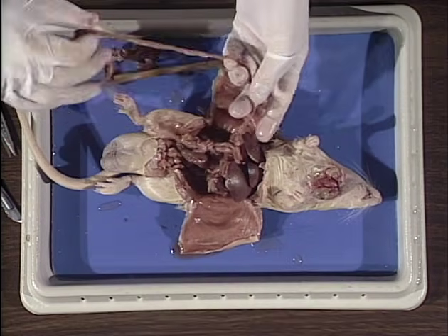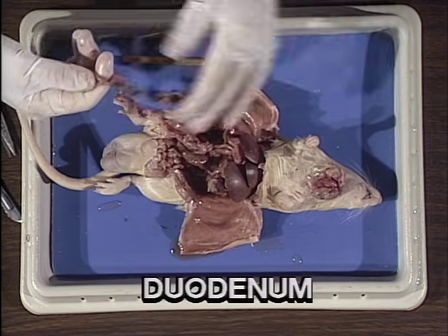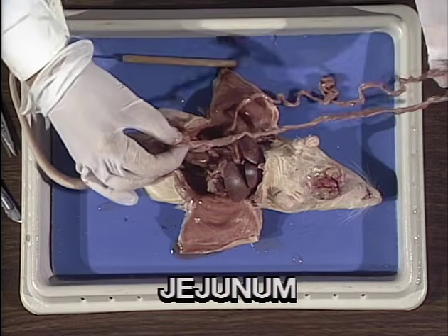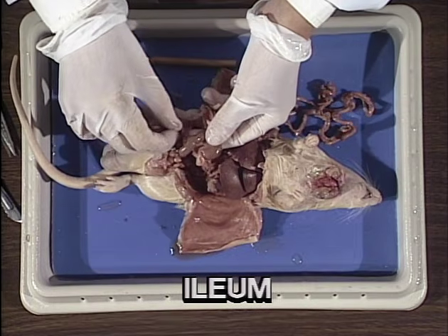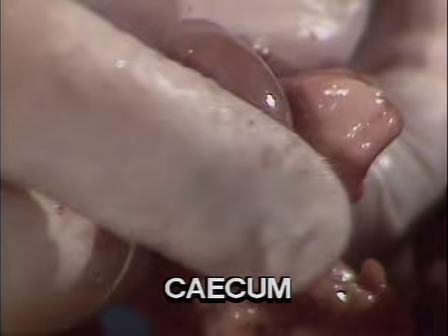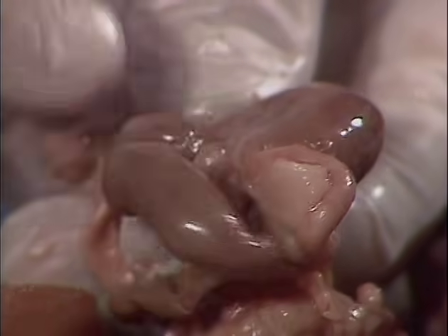The first part of the small intestine is known as the duodenum. The next portion is known as the jejunum, and the last portion is the ileum. The ileum joins up with a bag-like structure known as the cecum. The cecum is similar to the vestigial appendix in man, however it is quite large.